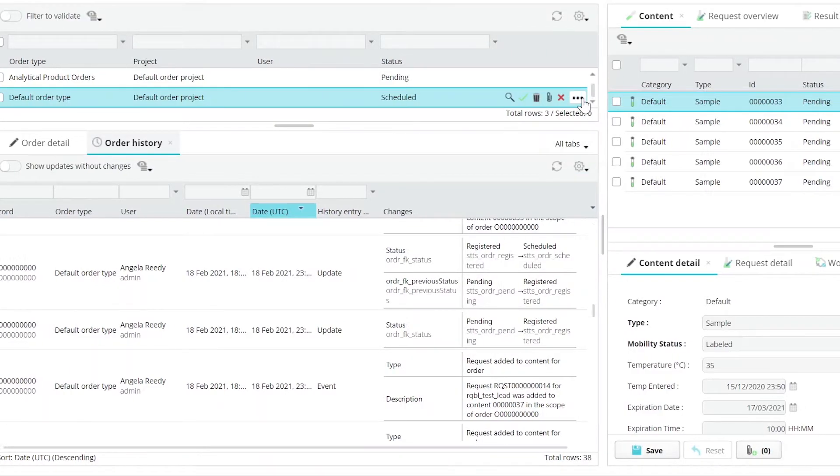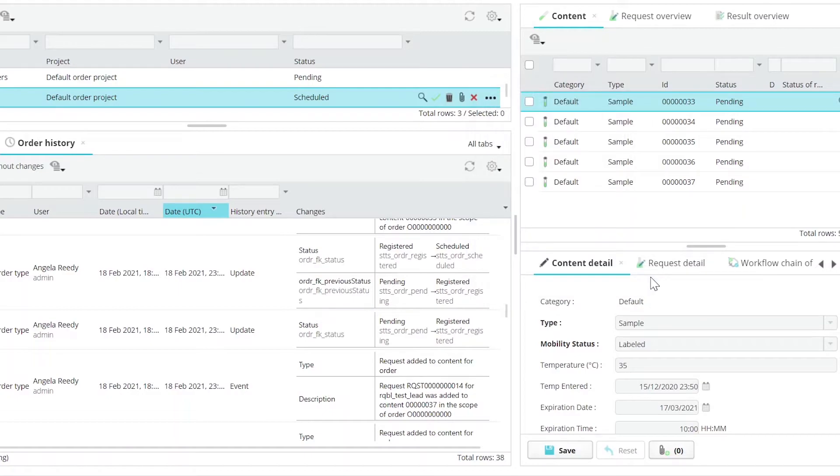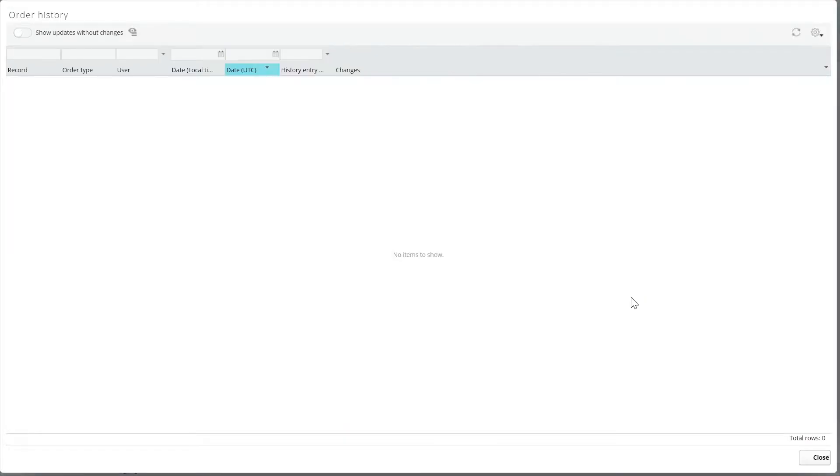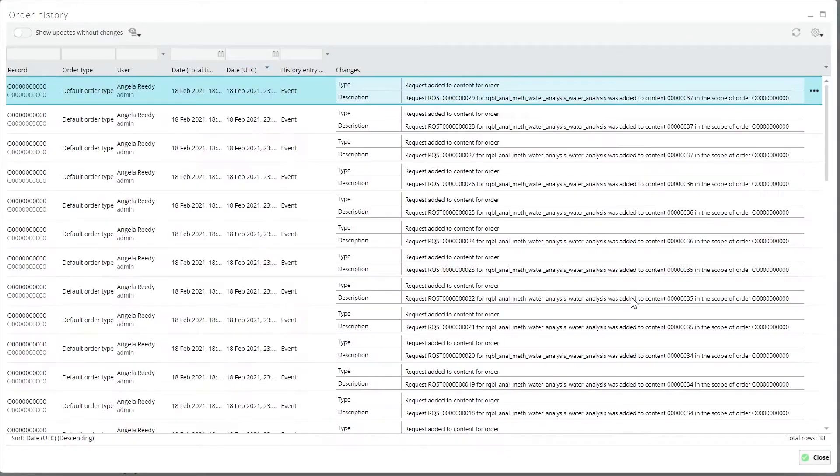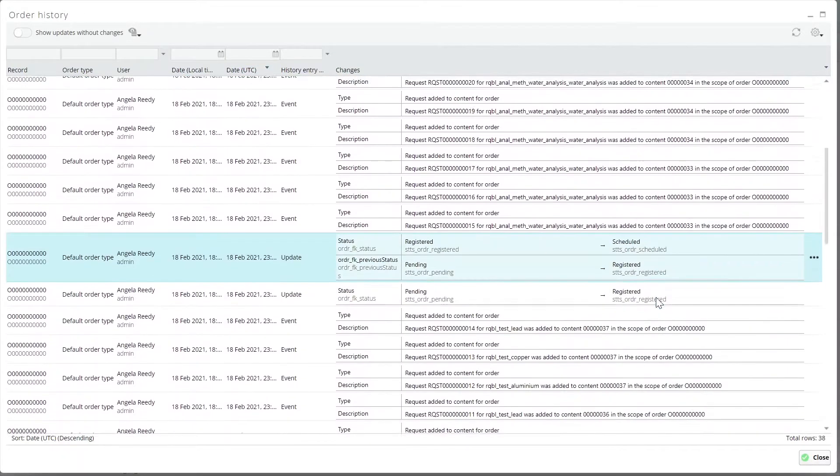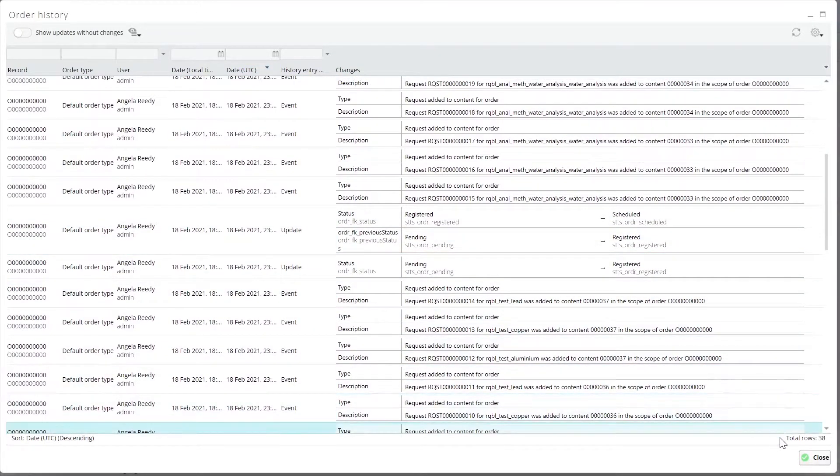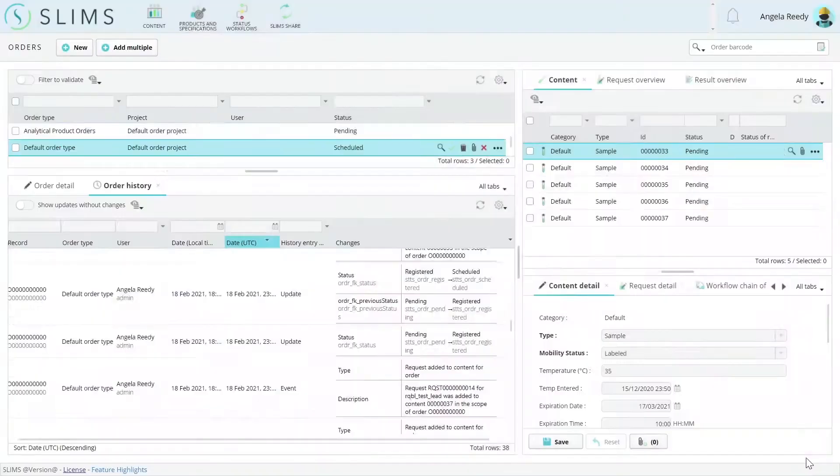By the way, you can right-click and choose the history action for instruments, orders, records, and so on now, not just for content.